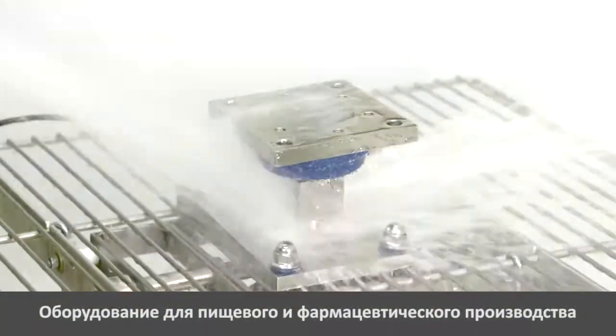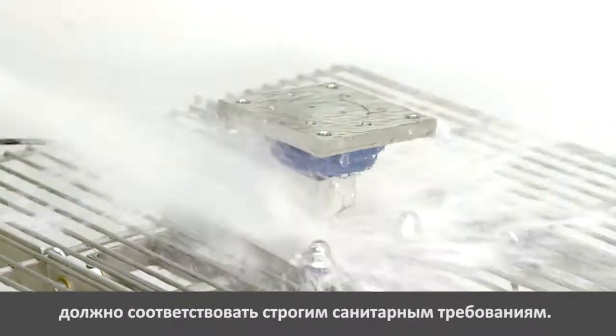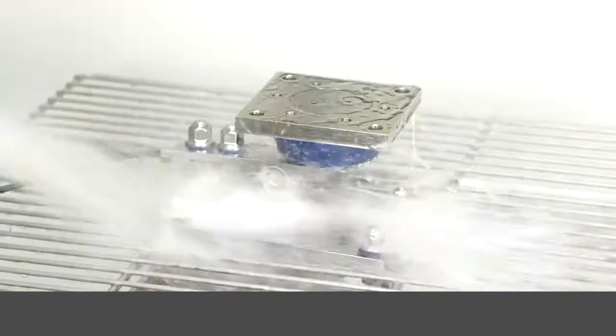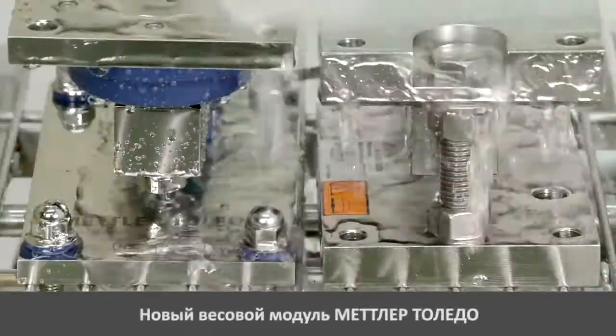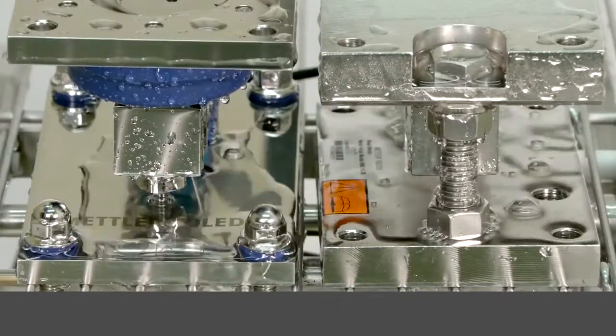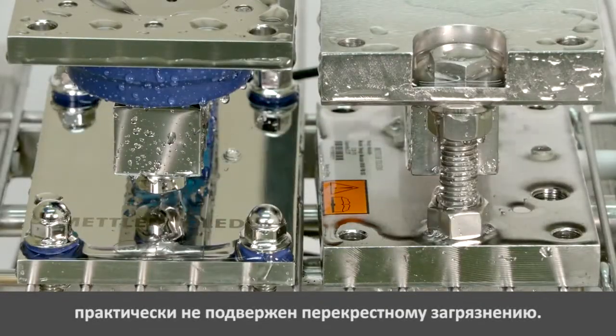Regulation for food and pharmaceuticals requires manufacturing with hygienic equipment. Mettler Toledo designed a new whey module that dries faster and bears less risk for cross-contamination than a traditional whey module.